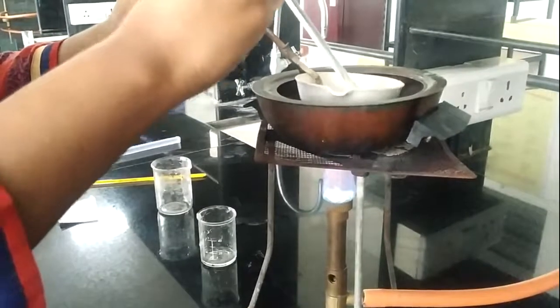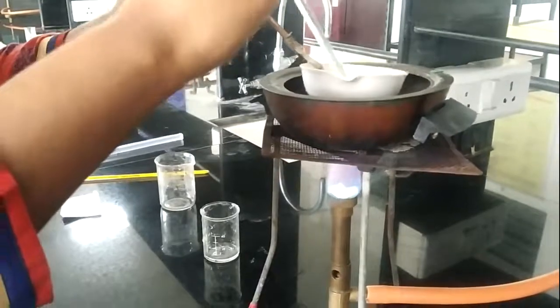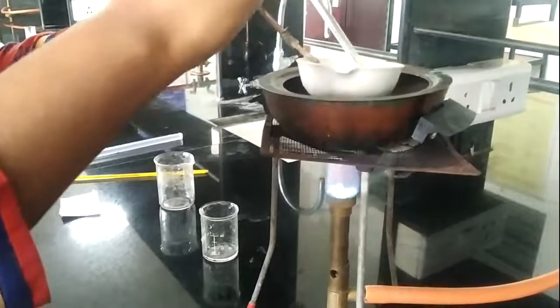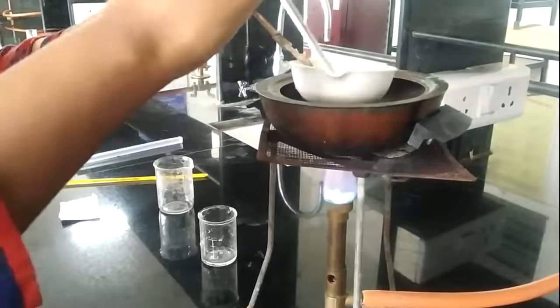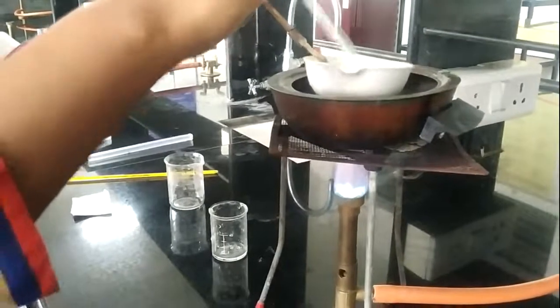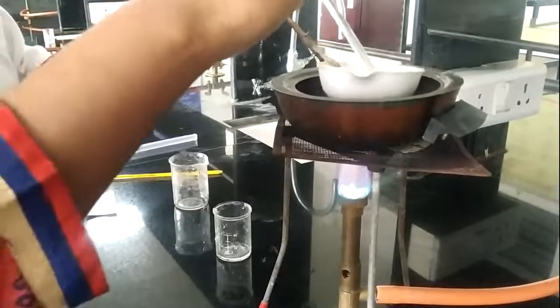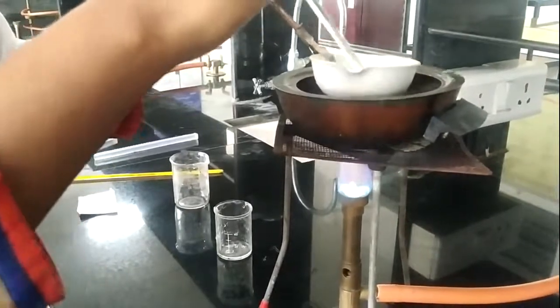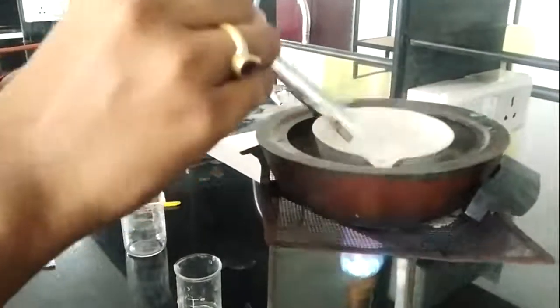I am heating it on the water bath. As our base, the cocoa butter, is going to melt, let's see, this cocoa butter is completely melted.